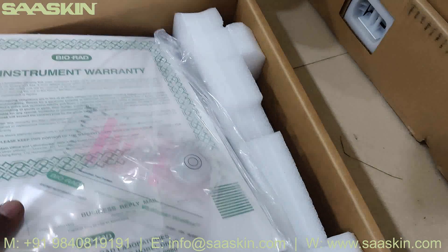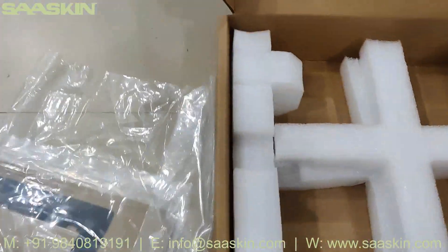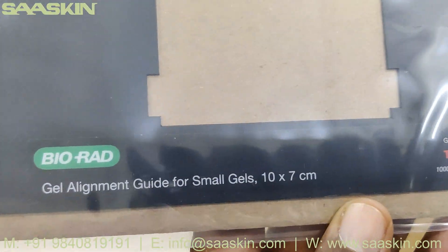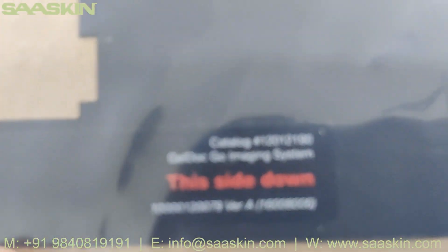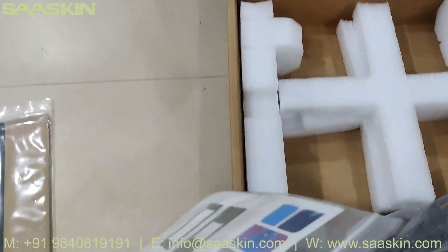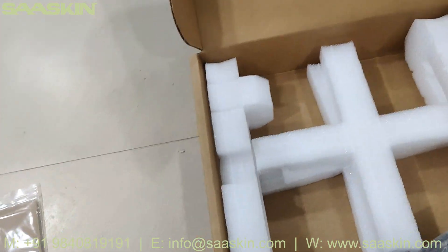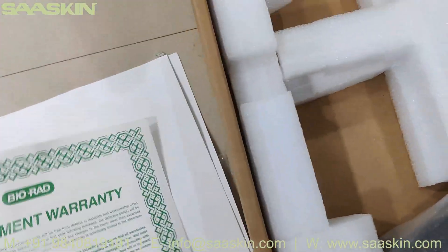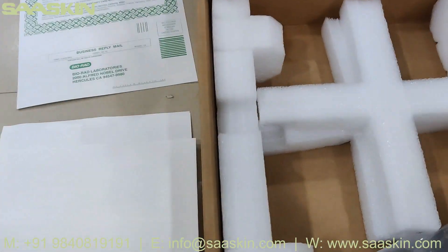Here we go — you can see inside the cotton box. You can see a booklet that shows the instrument warranty details. You will get the cloths covered. Pulling this out, you can see it is upside down — there is a plate for supporting, and you can also see here a gel alignment guide for small gels, 10x7. And then you get the warranty card inside. There is a warranty booklet.